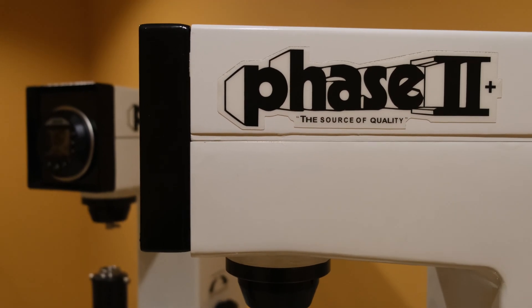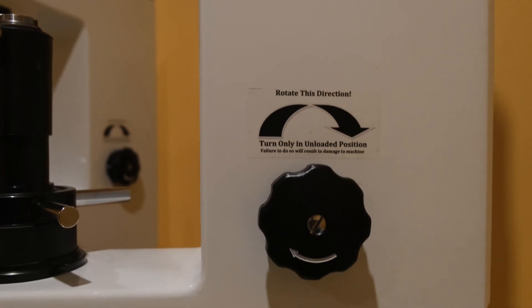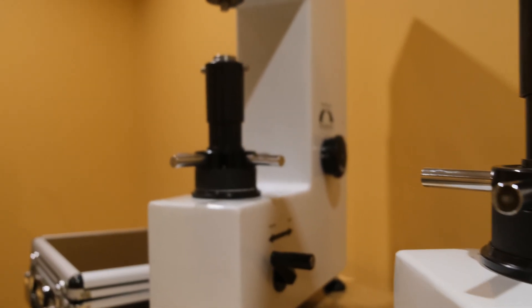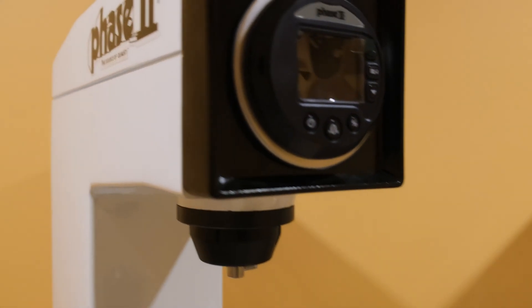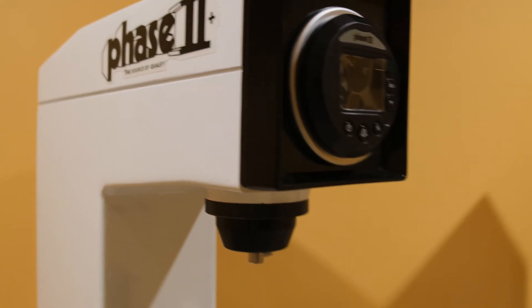This is an instructional video detailing the applications and functions of the Phase II 900331 and 900331D Rockwell hardness testers. These hardness testers are designed to test primarily metals using the Rockwell hardness method via a deadweight driven control. The 900331 can also be upgraded with a digital indicator for simplified readout, scale conversion, and the ability to save results automatically.